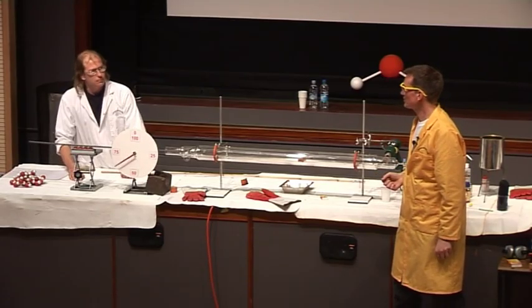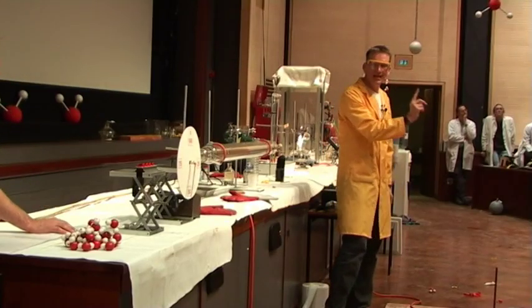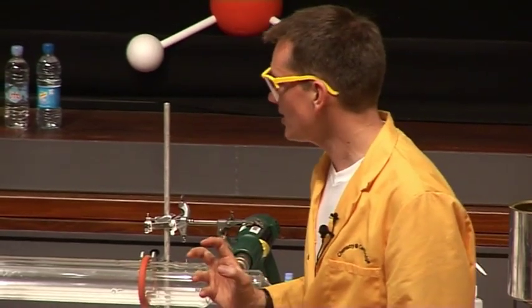Is it going to get to 1,000? Yes, that's 1,000. So this is, remember, 1 millilitre of water. It's turned into 1,100, and it's still expanding.